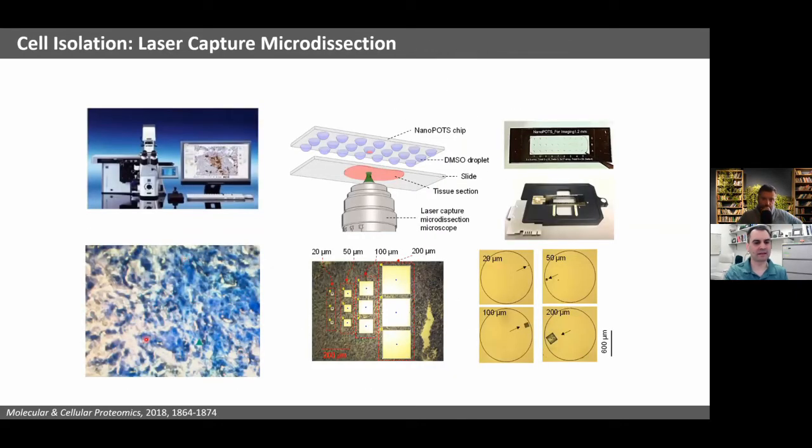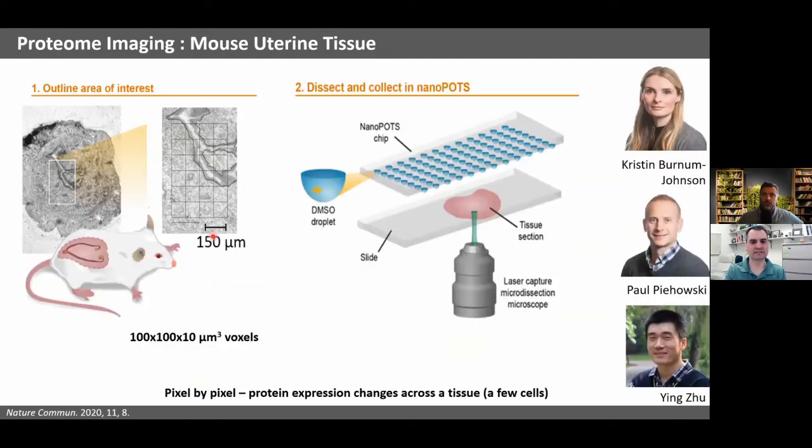We've also automated the transfer of tissues. The little video is not that important, but we can laser microdissect from plant or mammalian tissues and transfer the dissected regions directly into our nanowells for sample processing. And basically the sample preparation workflow doesn't change, just the sample isolation method changes.